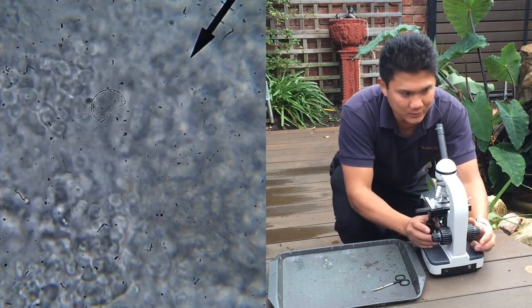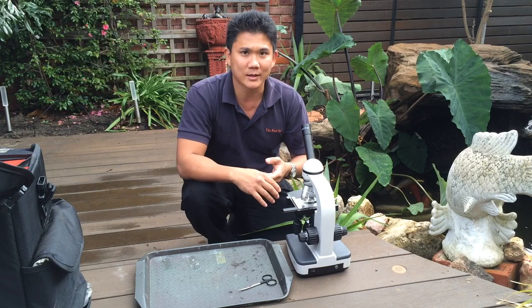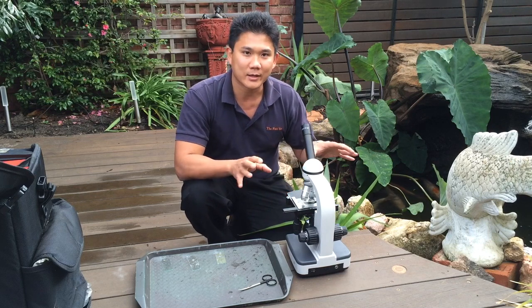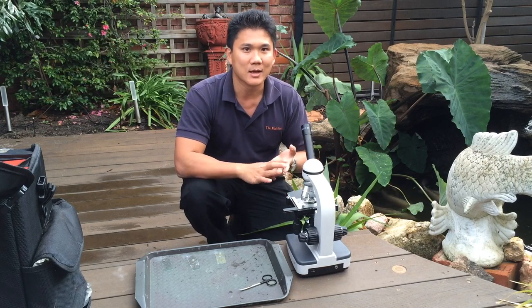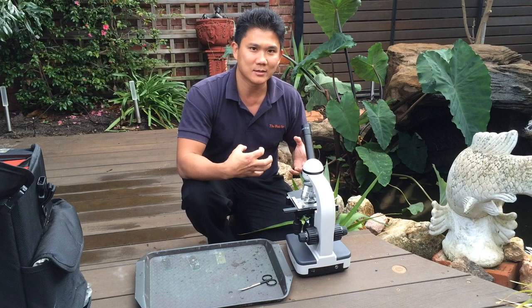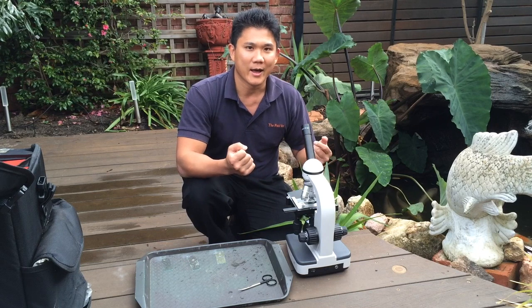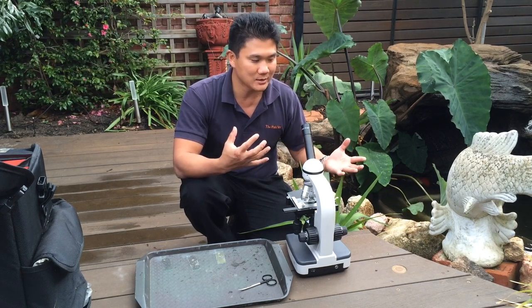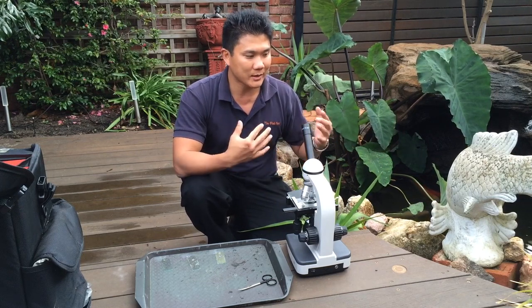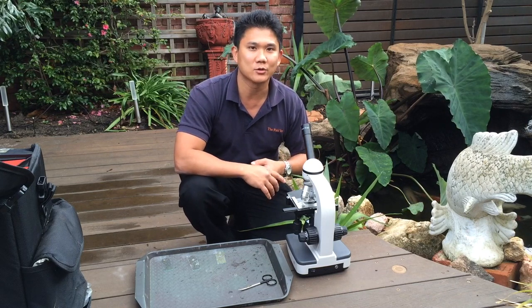Normally if you find two or three of these in a skin mucous scrape, that's not a problem. But in these numbers it is going to be an issue. The reason is I think there's probably too much organic matter in the water — they tend to graze on these things. But in numbers as high as these, they will start latching onto the fish, grazing on the skin mucous, causing irritation, inflammation, and dermatitis in the skin, and then the fish are going to come down with disease. So what we really need to do is give a good clean of the environment, and possibly treat with a little bit of formalin at the lowest dose, which is about 0.125 mls per litre.